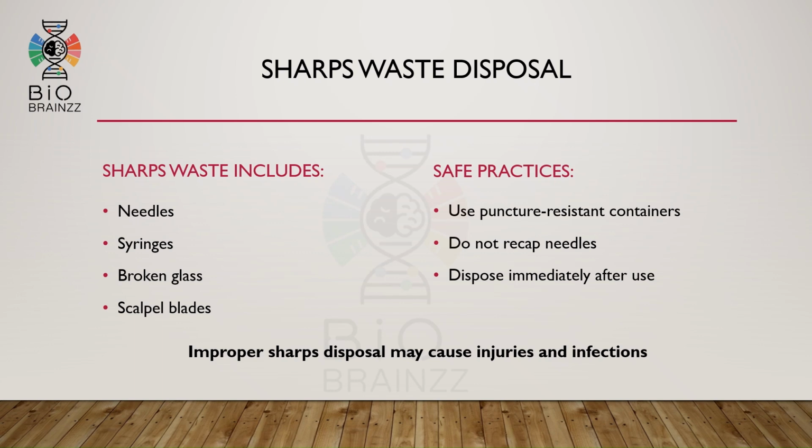Sharps waste includes needles, syringes, broken glass, and scalpel blades. These materials can cause injuries and infection if not handled properly. Sharps should always be disposed of in puncture-resistant containers. Needles should never be recapped after use. Sharps waste must be discarded immediately after use to prevent accidents.